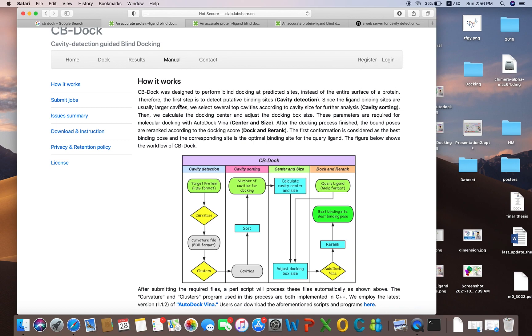The first step is to detect the putative binding site — that is the cavity detection. Ligand binding sites are usually larger cavities, so the software detects several top cavities according to cavity size for further analysis. After cavity detection, the docking center is calculated and the box size is adjusted — the grid box in which you want to dock your ligand. These parameters are required for AutoDock Vina molecular docking.